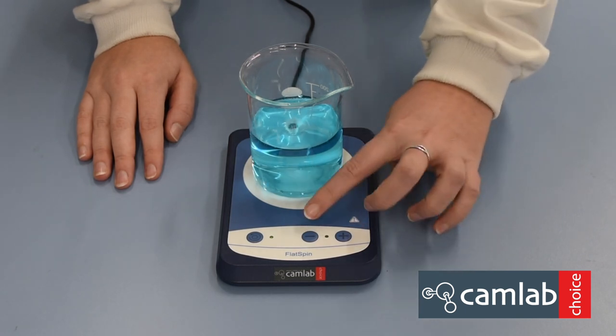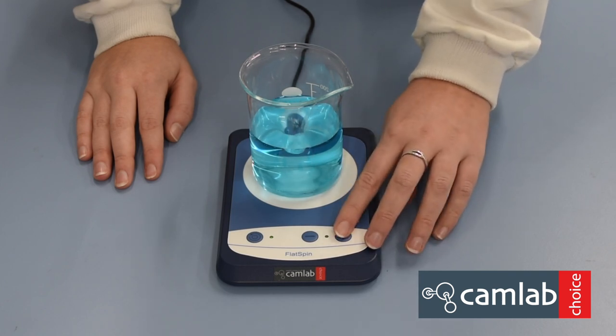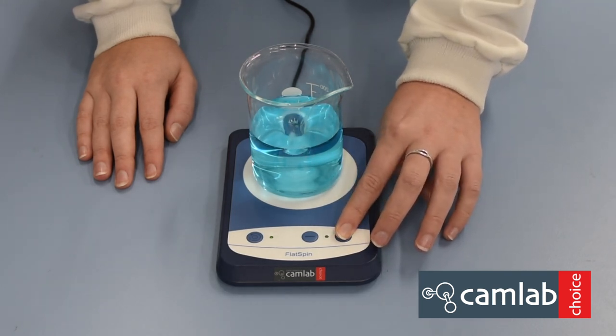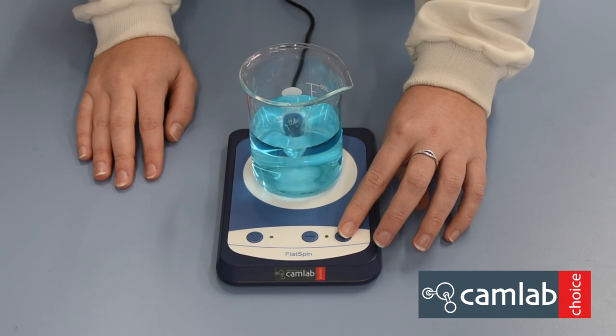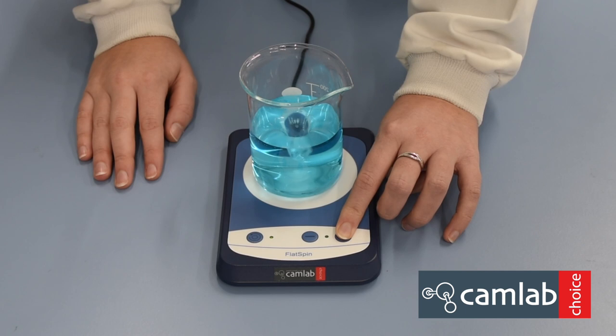Use the plus and minus buttons to increase and decrease your speed. The stepping rate is 10 rpm. Press and hold the plus button to increase your speed continuously.